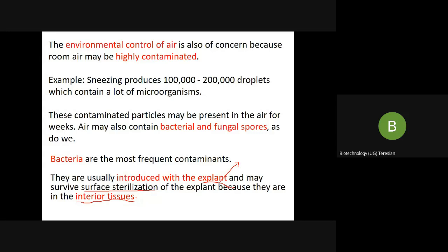To avoid contamination, we use laminar air flow, but the laminar air flow itself can get contaminated. Whenever you are placing the laminar hood, you should see that it is not directly facing the door, because doors are frequently opened. If the laminar hood is placed near the door and the door is kept open, it will get contaminated. If there is no option, you have to keep a double door so people can pass through one door before reaching the laminar hood.